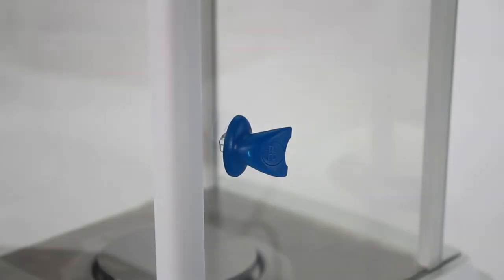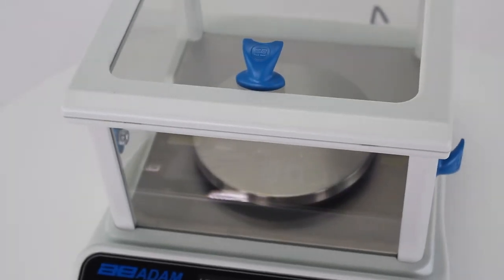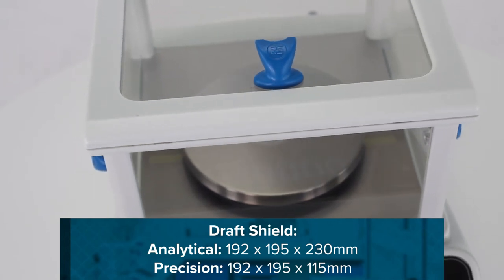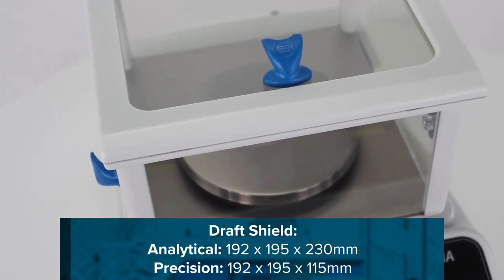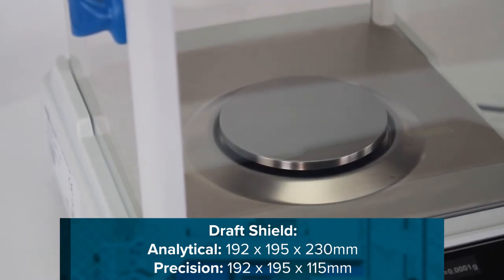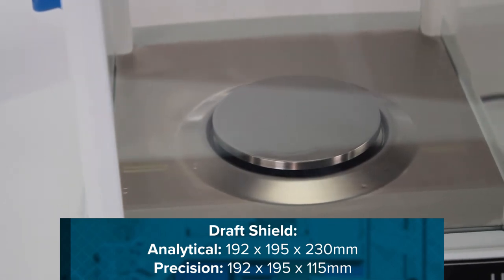To minimize the effects of air currents or similar disturbances, LUNA analytical models and precision models up to 820 grams include a draft shield. The draft shield's chamber measures a generous 192 by 195 millimeters. For analytical models, the shield is 230 millimeters tall, while the precision model shield is 115 millimeters tall.